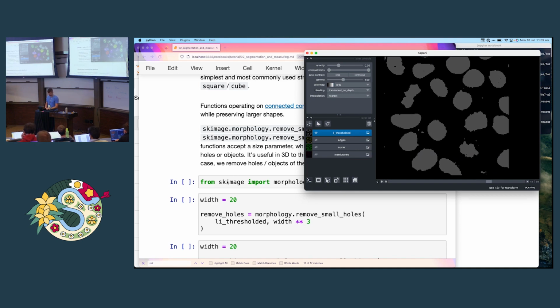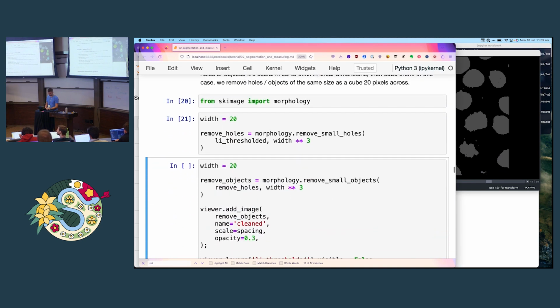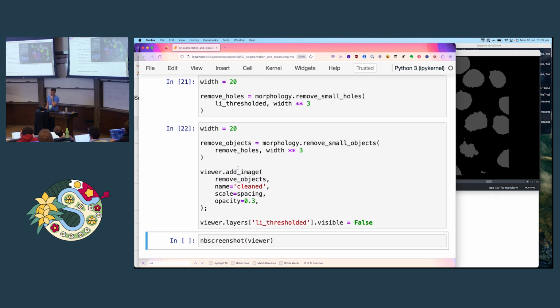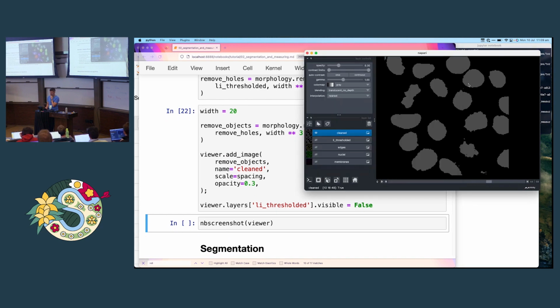So we come to our next exercise. I want you to try any of these approaches, whatever you are thinking about, to see if you can automatically find something that is closer to 1 point per nucleus. And we'll spend a few minutes with that. And then I will crowdsource the solution. And then we'll see what else we can do about it.